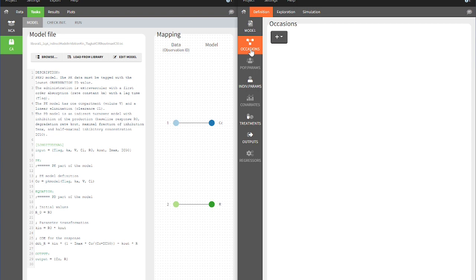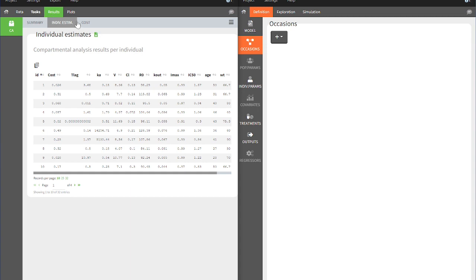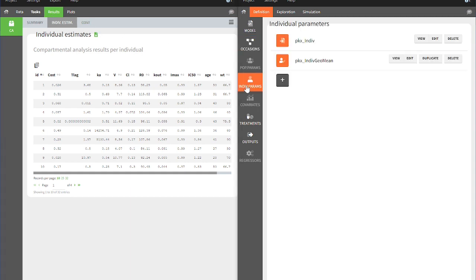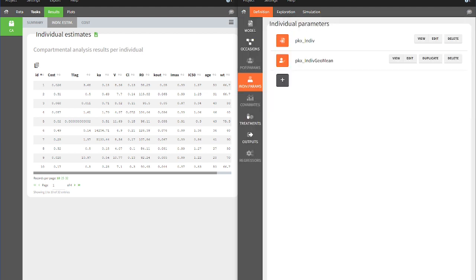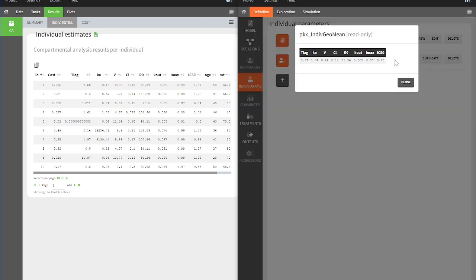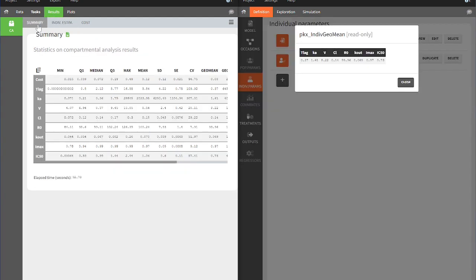The individual parameters estimated from the CA in PK-Analyx are in the Individual Parameter section in the Definition tab under the name PK-X-Indiff. The element PK-X-Geo-Geo-Mean here contains the geometric mean of the individual parameters that can also be found in the Results tab of PK-Analyx.